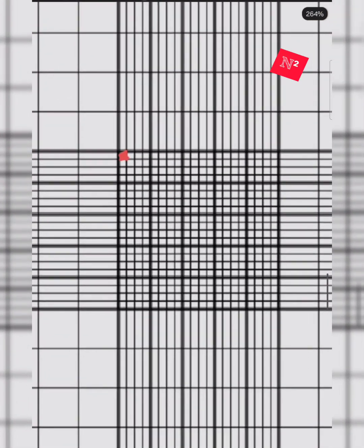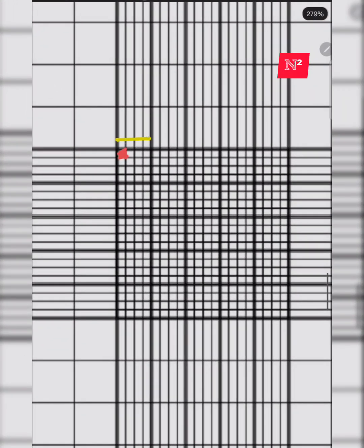So this was 1 by 5. You can see the triple lines are dividing the square's length into, sorry, 4 equal parts. So what will be the value of this individual length? That is 1 by 5 divided into 4 parts, that is 1 by 20.